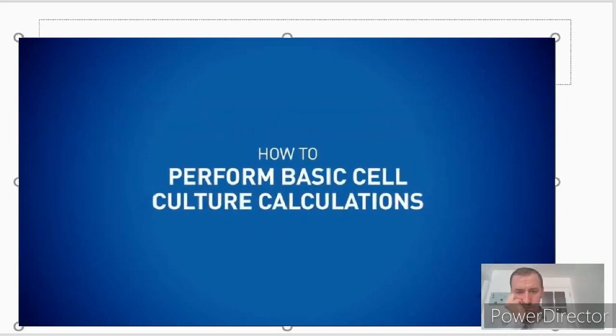The hemocytometer and these equations help us determine cell density and viability. Based on this, you can also create growth curves or calculate the best window for cell passaging. You'll find more information on how to perform these basic cell culture calculations in a separate video.